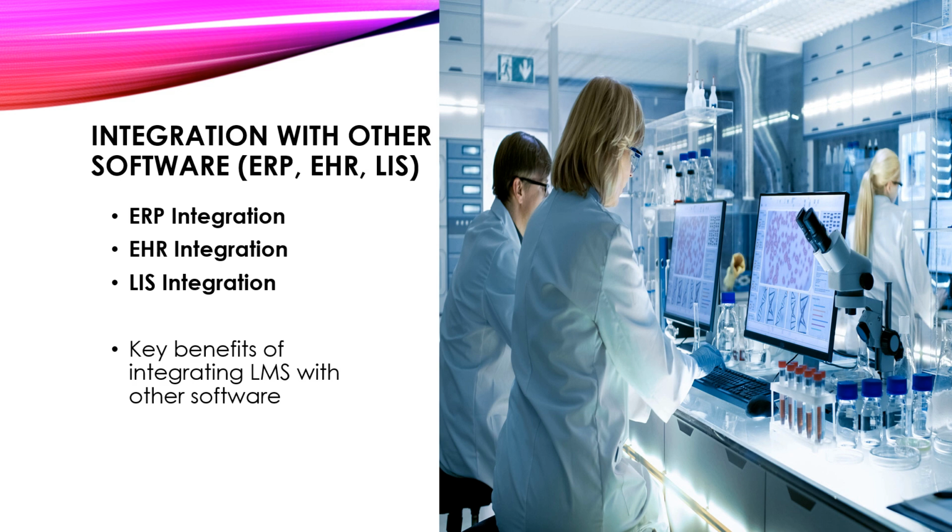Enhanced accuracy is yet another benefit of integrating LMS with other software. Integrations minimize the risk of errors associated with manual data entry and ensure data consistency across different systems. Better decision making. Access to comprehensive, up-to-date information facilitates informed decision making by healthcare providers, administrators, and other stakeholders.